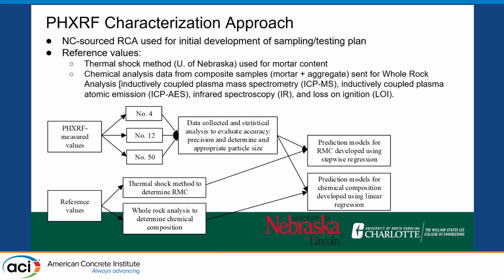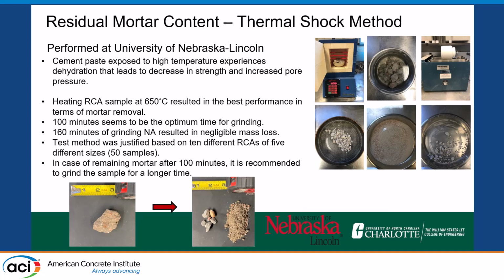We basically collected data with our handheld XRF, and we developed models to try to see if we could accurately predict what we were getting through the more expensive, more intensive lab testing that's usually out of reach for folks who really want to use recycled aggregate. And so what we did, just a little bit on this thermal shock method and a plug for Dr. Hu's work at University of Nebraska-Lincoln.